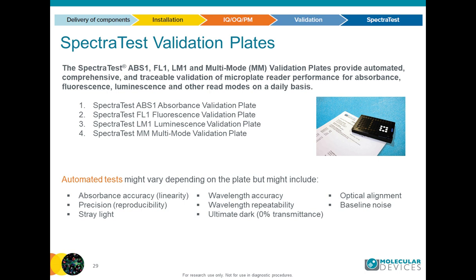Modes like time-resolved fluorescence and fluorescence polarization are performed using the multimode plate. And the tests include accuracy, reproducibility, wavelength accuracy, and so on.